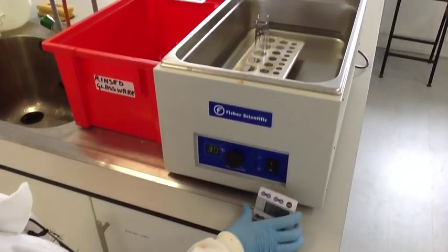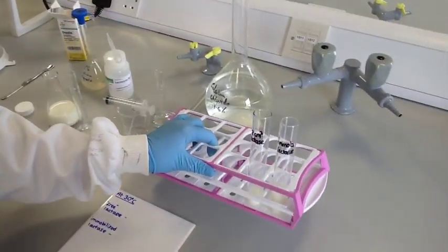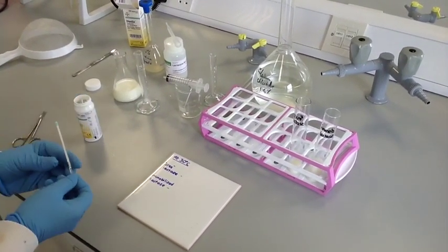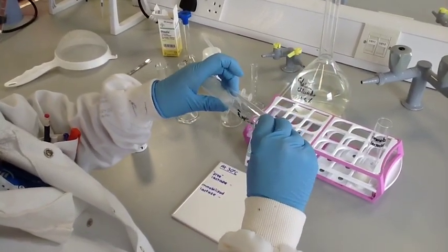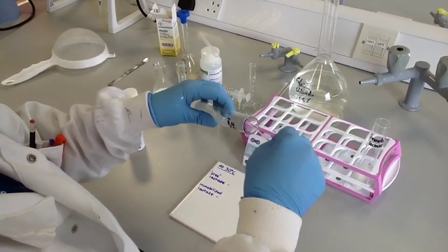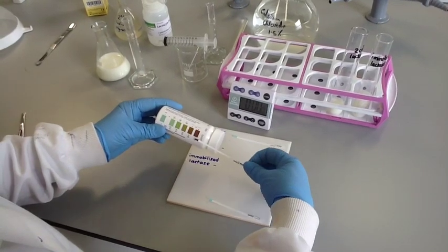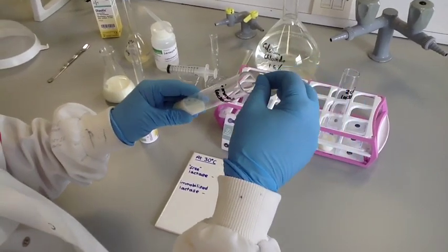After 5 minutes, remove your samples from the water bath and test each one for glucose. These glucose testing sticks are read at exactly 30 seconds, so students should use their stopwatch. The presence of glucose at this stage will indicate that the lactase enzyme has broken down the lactose in the milk into glucose and galactose. You should find that glucose is present in the milk with both the free enzyme and the immobilised enzyme.